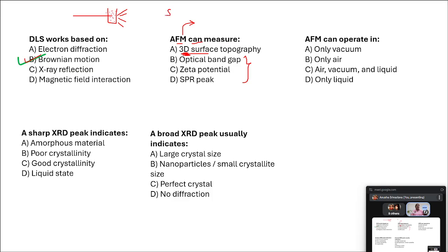In the case of SEM, we were sputter coating the sample with some conducting material like gold or copper. But in the case of AFM, we don't need that kind of coating. So in this sense, it's better. Just revising that point. So yes, the correct answer is A.